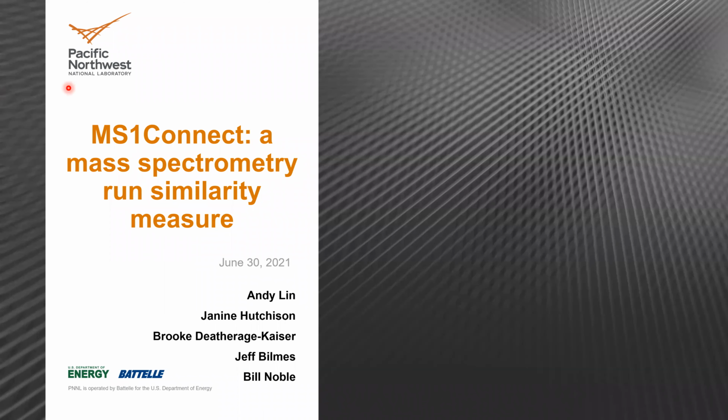Hi everyone, I'm Andy, and today I'm going to talk to you about a new method, MS1Connect, that uses MS1 scans, or intact peptide scans, to measure the similarity between pairs of mass spectrometry runs.